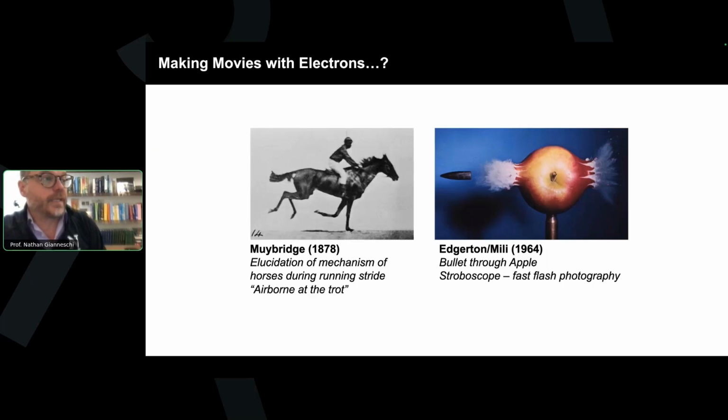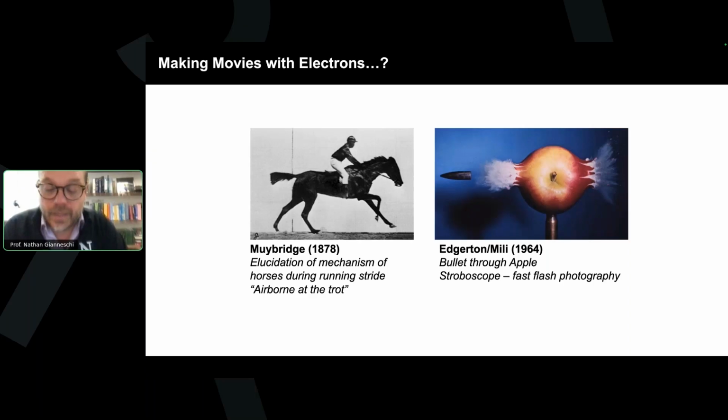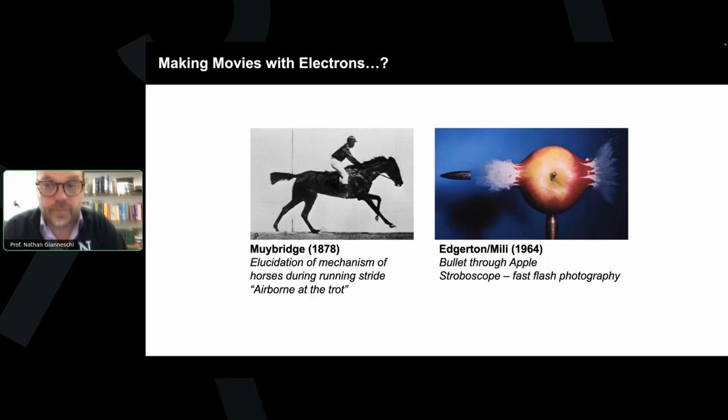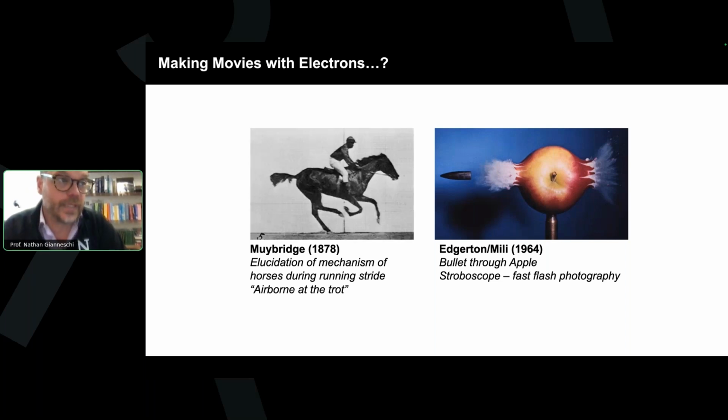The main one being that we're damaging these samples as we're imaging them. And so we need to both pick interesting experiments to do and develop methods for mitigating things like damage, or at least understanding the role of the beam in these processes that we aim to study dynamically.